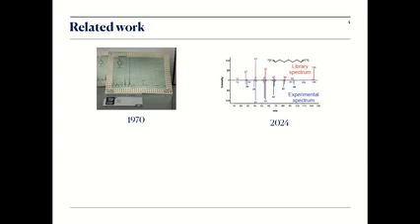Historically, since the 1970s, the most dominant method for the interpretation of tandem mass spectra is simple spectral library lookup, where given a new experimental spectrum which we want to annotate, we simply compare it to reference library standards, and if we find a similar spectrum, we conclude that the corresponding spectrum also has a similar molecular structure.